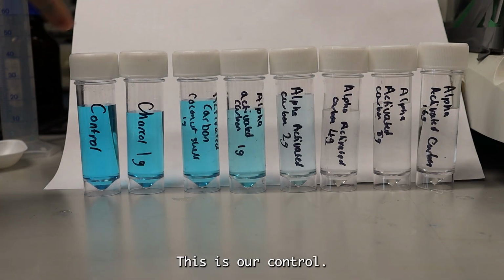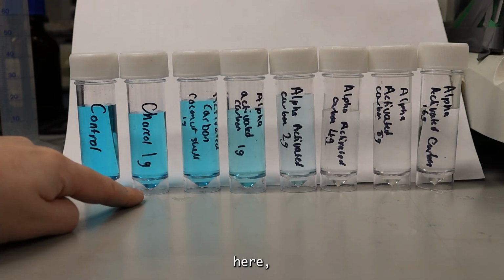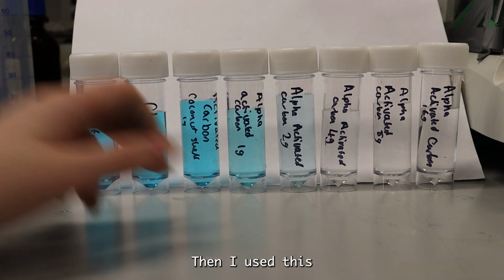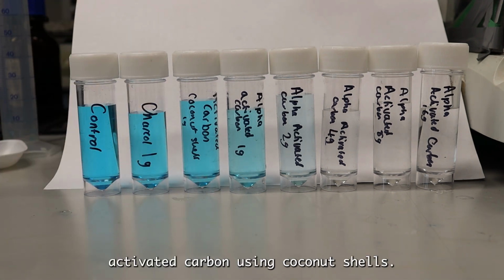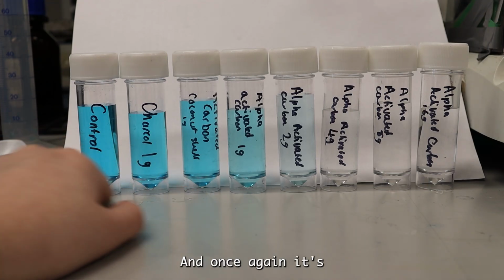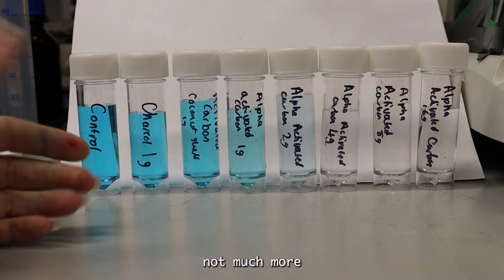This is our control. This was 1 gram of charcoal, and as you can see here, it is very slightly lighter than control. Then I used this activated carbon using coconut shells. That was also 1 gram. And once again, it's very slightly lighter than the charcoal, but once again, not much more lighter.